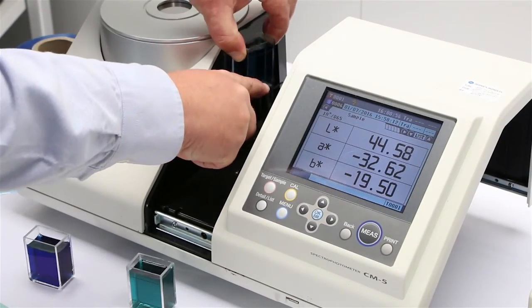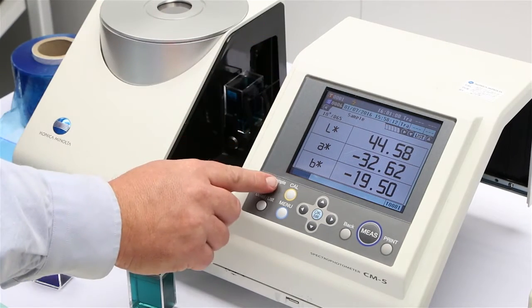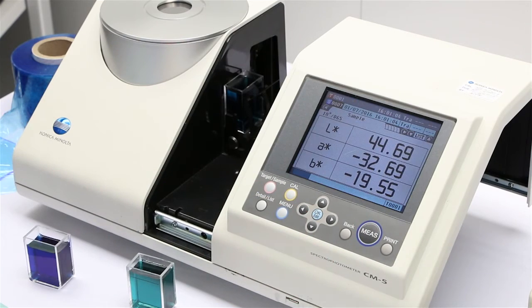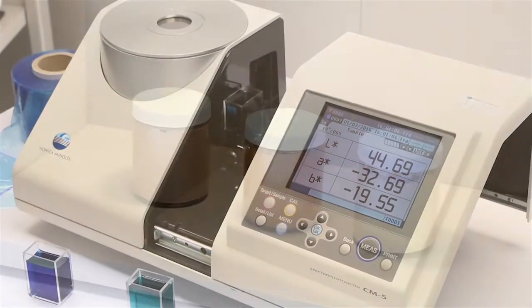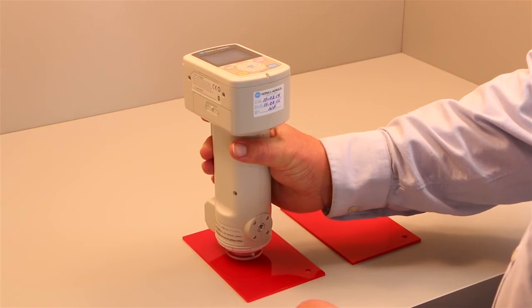Color samples that fall within set tolerances of a spectrophotometer or colorimeter may look different to the human eye. We have a different sensitivity to the hue and saturation of colors. For example, we can visualize color difference in neutrals and pastels better than we can tell the difference between highly saturated colors.